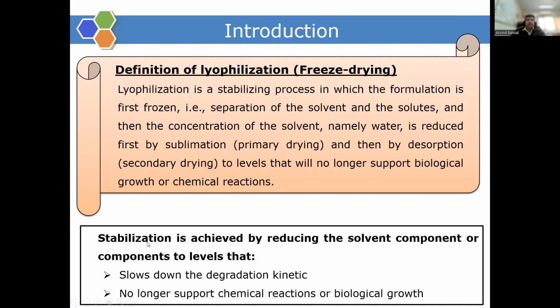Stabilization after lyophilization is achieved by reducing the solvent component or components to a level that slows down the degradation kinetics, which no longer supports chemical reactions or biological growth. In the majority of cases, this solvent is water, which is removed during the process of lyophilization.